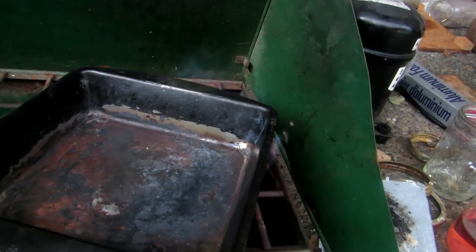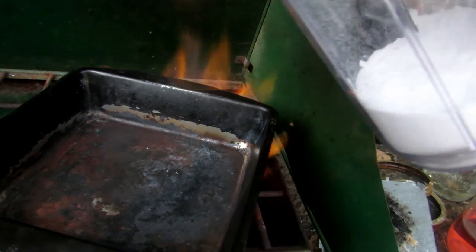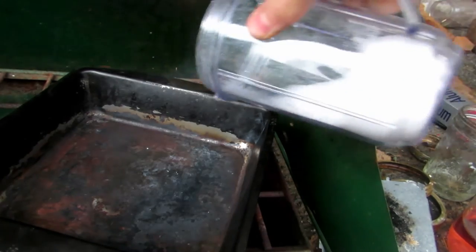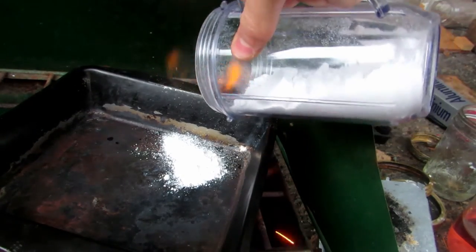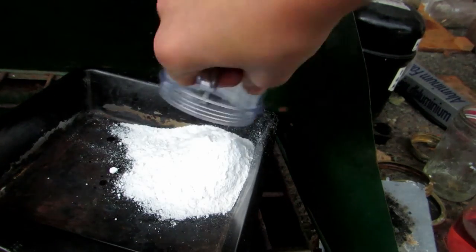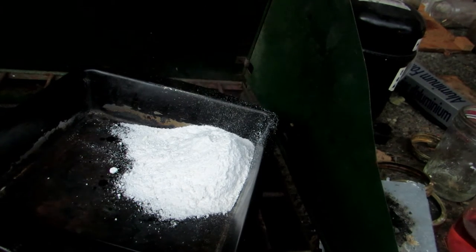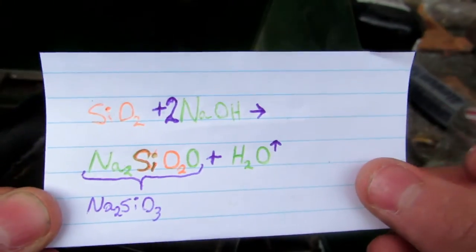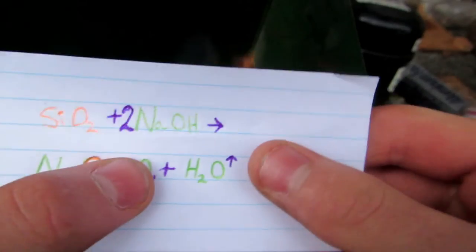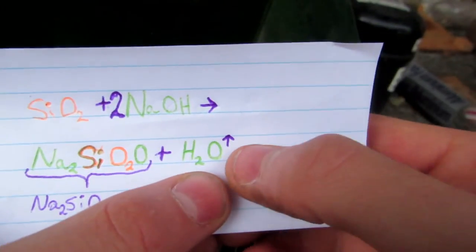As you can see, we've concentrated all the heat on one corner so that it gets nice and hot. We can now go ahead and take out our mixture powder and pour it into the one spot that's nice and warm. The decomposition will start to begin. We will now just leave that there and mix it around occasionally to make sure that everything reacts. The following reaction is: silicon dioxide plus two sodium hydroxides react to form sodium silicate and water, which goes off as a gas.